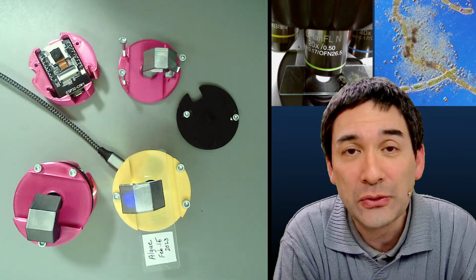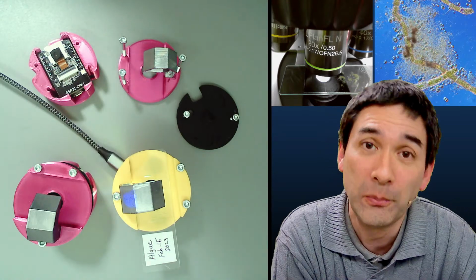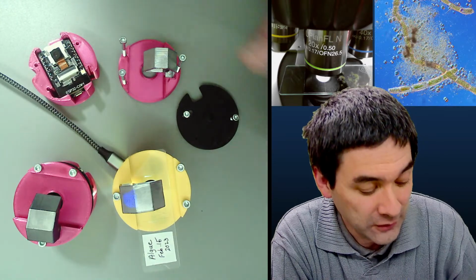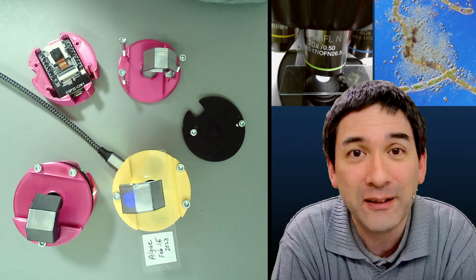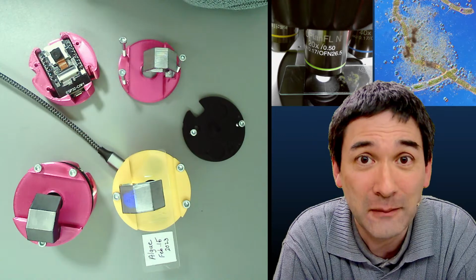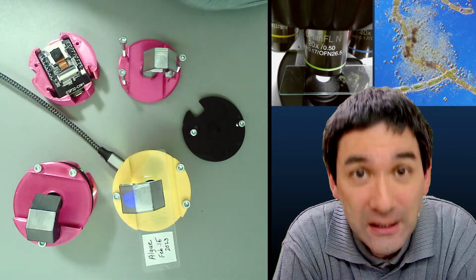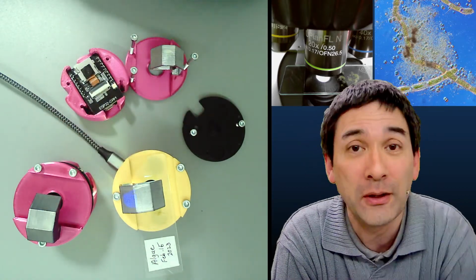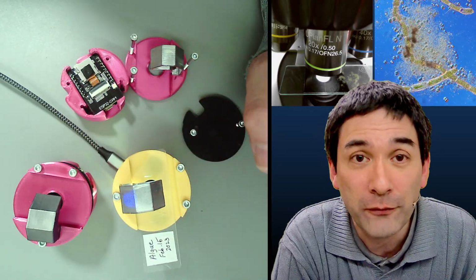Okay, what I will do today is the following. In order to structure today's live stream a little bit, I'm going to break it apart into different sections. I'm going to show you today a little do-it-yourself project over here. This here is a very, very cheap and a very fun microscope to use. It was sent to me from someone who's working on this project. I put the links into the description. It's 3D printed, and there is a camera module here. So I'm going to be talking about this here as well. And you can see that I already put a slide in here. Very cheap and very fun project to use.